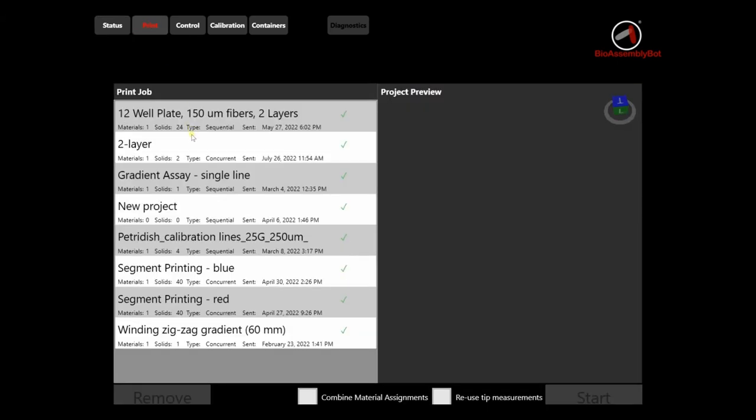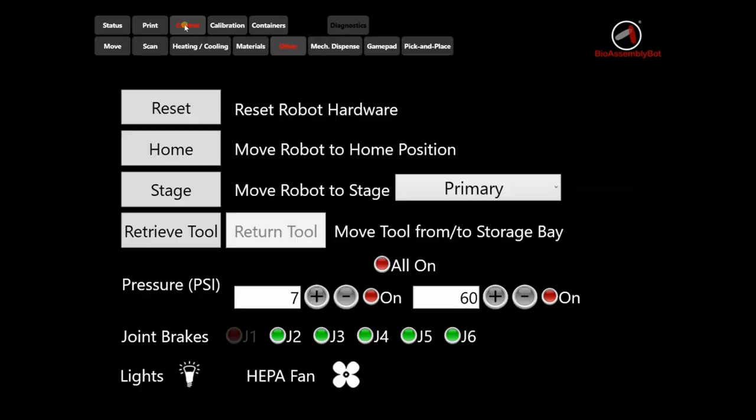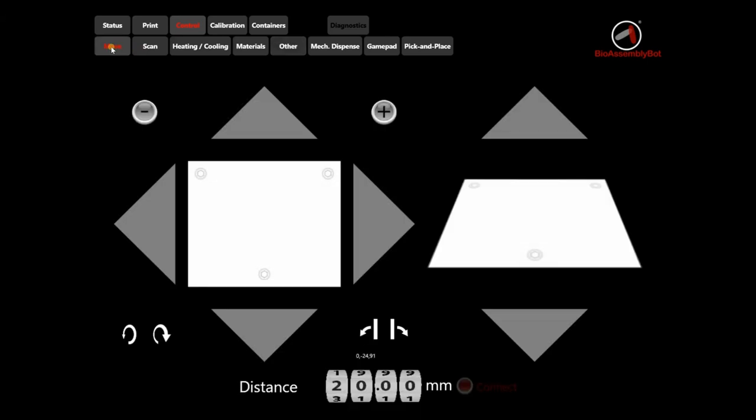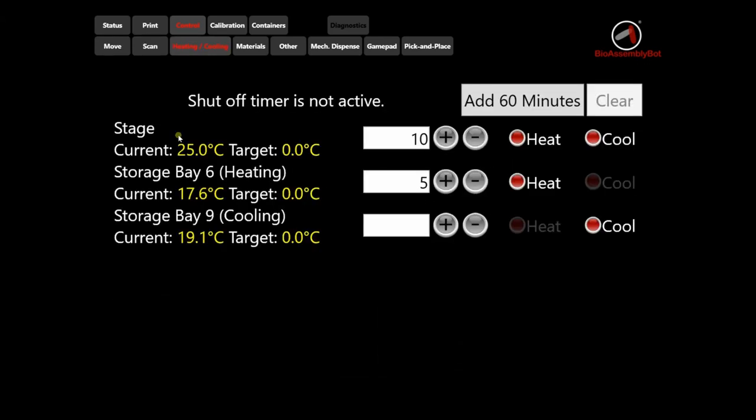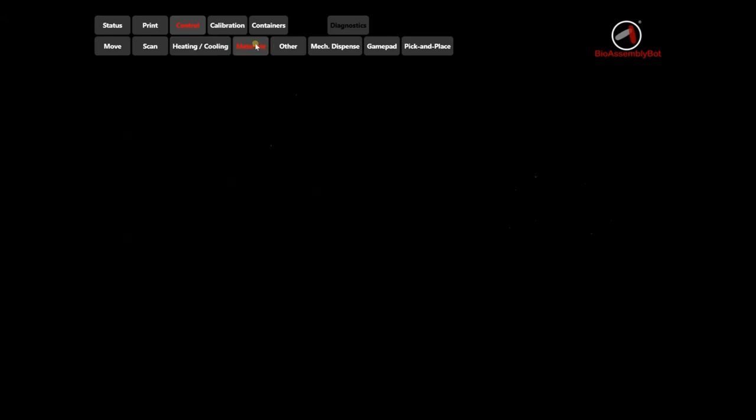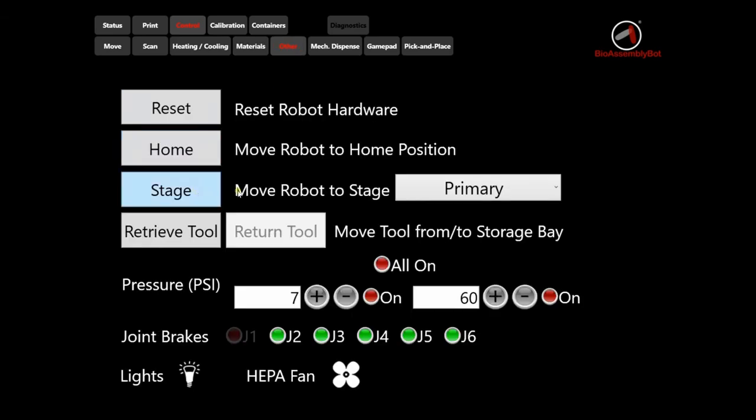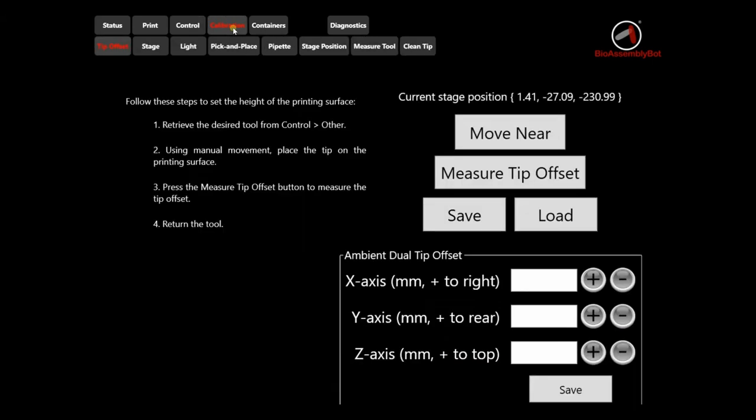Under print menu, we can find various print jobs sent to the printer. Next is the control menu. Here we have multiple submenus for various operations. We can use the move menu to move the robotic arm for needle calibration, the scan menu to scan a surface and set it as a new printing surface, the heating cooling menu to control the temperatures of printhead and print bed. Materials menu is available during the printing process to adjust printing speed or extrusion pressures. Other menu has several options to retrieve and remove printheads, to optimize extrusion pressures, etc. Next is the calibration menu. We use this for calibrating the needle tip under tip offset submenu.